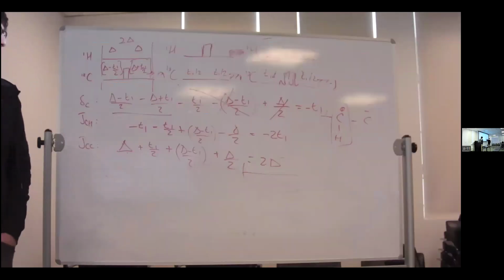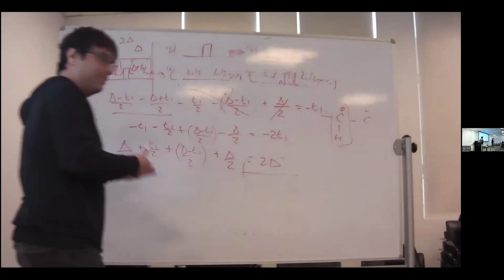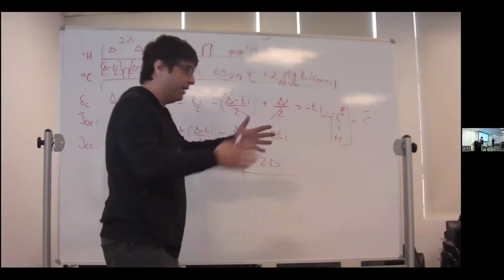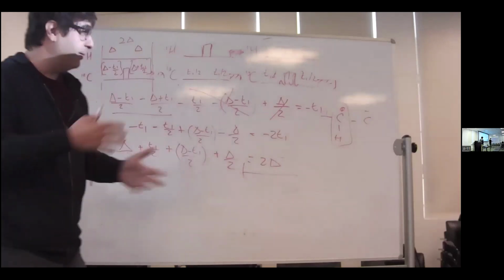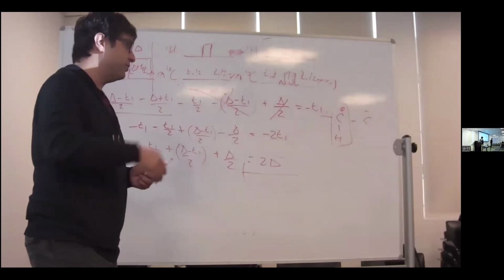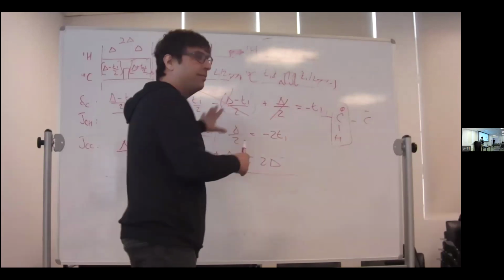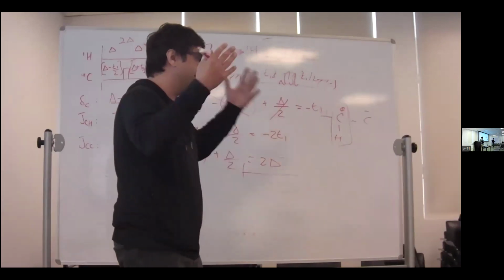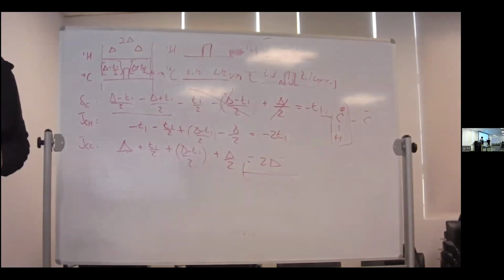It's just a brilliant sequence. I mean, it just works out that the chemical shifts get removed, and you can analyze. Whenever you have an NMR experiment, and you want to figure out what the spectrum is going to look like by just doing these additions and subtractions, you figure out whether something's selected or not. Of course, it can be a more complex experiment from this, but the standard HSQC variant experiment can be analyzed in this way. Okay, so that was our little exercise.